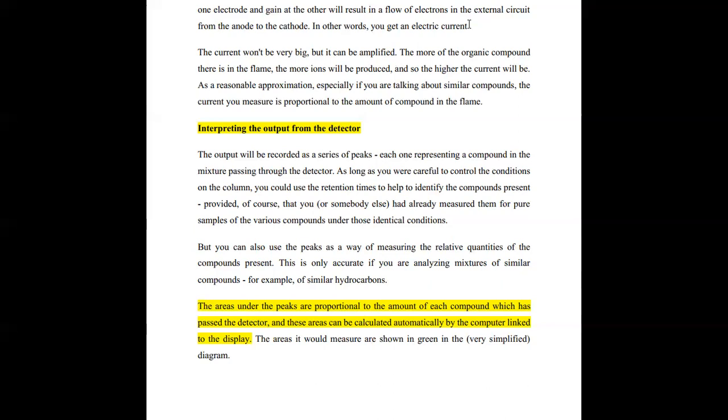But when you're in the industry, the computer does it for you. Because there you are learning, so you have to learn manually how to do it. Find time to check the infrared spectrum of water. You're going to see a lot of peaks like waves. How to interpret that? We were doing it ourselves, but in the industry, of course, the machine does it for you.